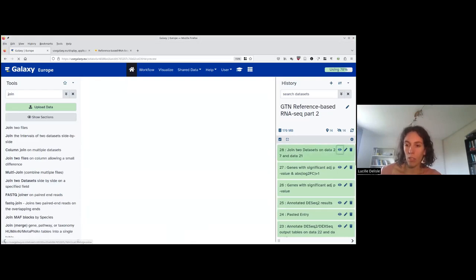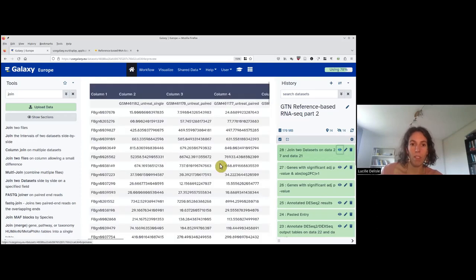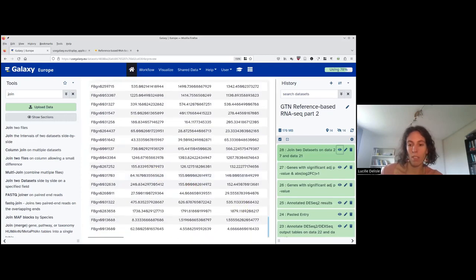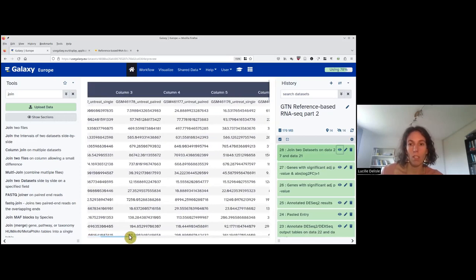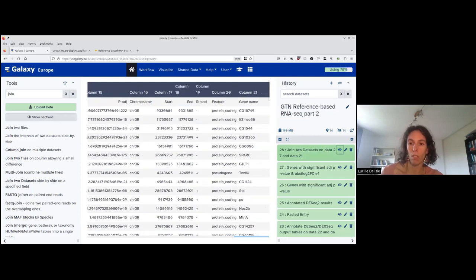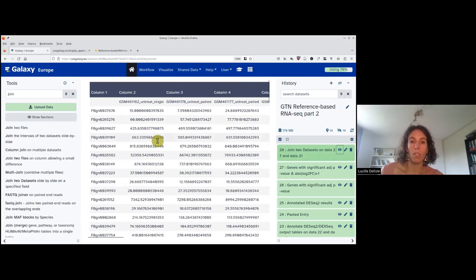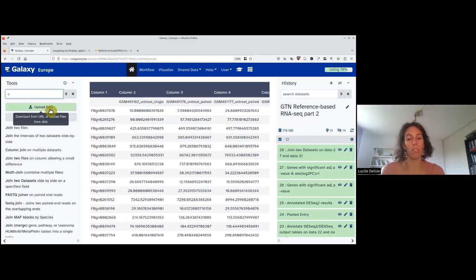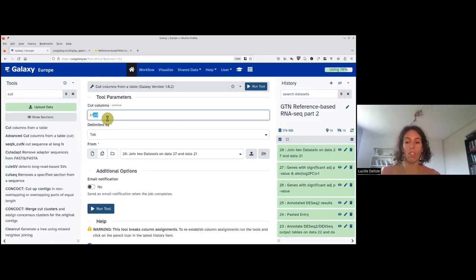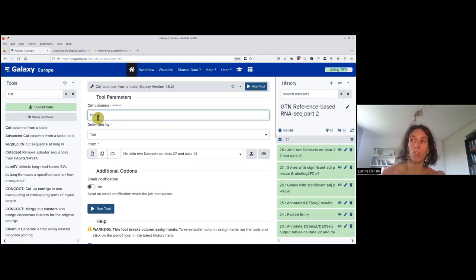The join has finished. Checking the eye icon: we have fewer lines — it has indeed restricted to the differentially expressed genes. On the columns, we have the normalized expression, then gene ID and everything from the DESeq2 output that we don't need. So we will use the 'cut columns from a table' tool to get only the first eight columns — C1 (gene ID) plus the seven sample columns (C1 to C8) from the join output. I run the tool.